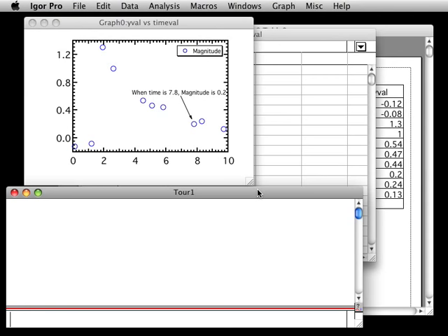At some point, you'll want to save the graphs, tables, and data, such as waves and data folders, as an Igor experiment. This is easy to do. Just choose the File Save Experiment menu item.